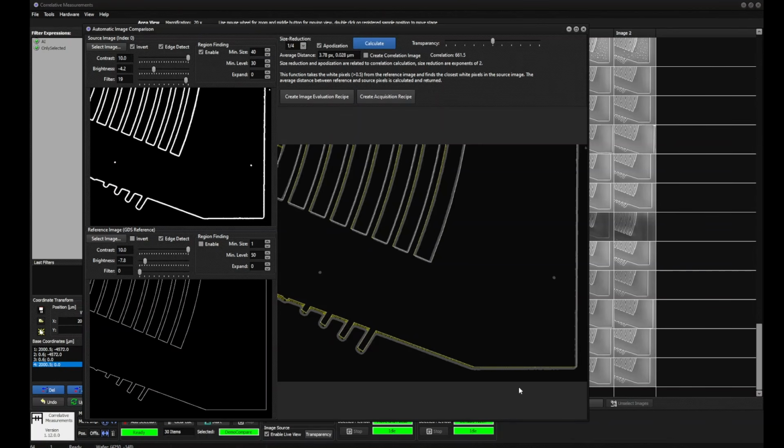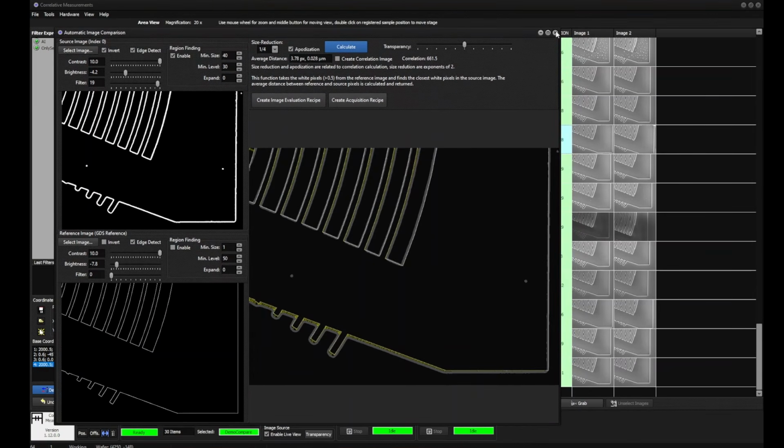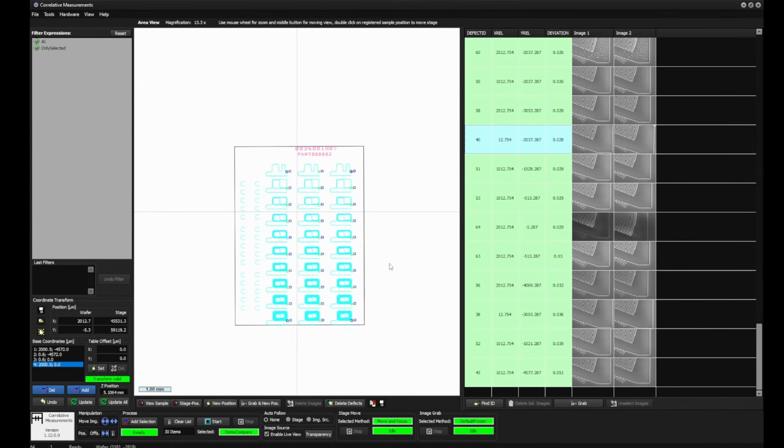Also from here to there. And this line is also quite okay, but we have a deviation here at this position now. So there are real differences at this magnification level. So this comparison test can give some information how the structures written on the chip are deviating from the original structure.